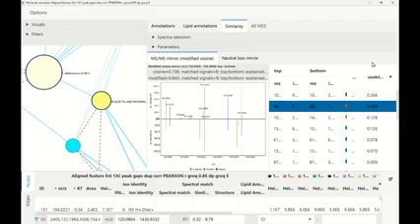Sometimes I was wondering, if you have a spectral library match, for example, there might be the precursor, which we filter out in MZmine. We filter the precursor signal out, but sometimes the precursor signal is just massive, and then all the fragments are quite small. And if you then just match these two signals, they might make up like 99% of your cosine similarity, and then you say, okay, I have a huge cosine similarity, but it was basically just a precursor signal matching, which is already a pre-filter. So be kind of careful then with the reporting.